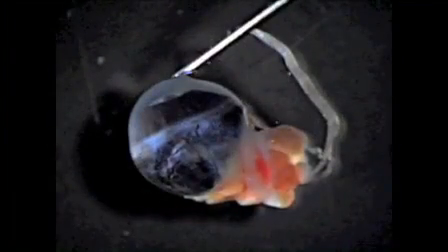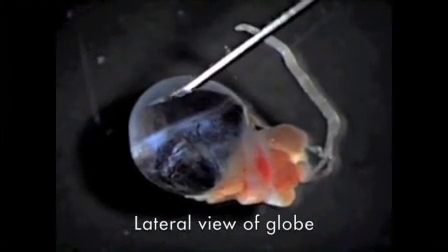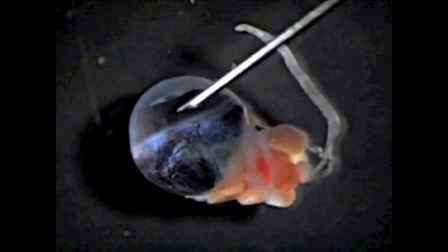Here is the surgical specimen. The needle is pointing to the clear cornea. We can see a little bit of the lens poking past the iris. The iris is here in brown, covering the lens.